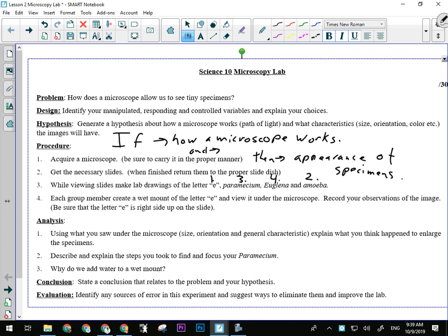There are different dye lots for those. Some of them are all blue, and some have some blue ones, some green ones, some brown ones, and some orange ones. It actually has to do with the genders. Paramecium have this weird thing going on, where they can reproduce asexually by splitting in half, but they can also reproduce sexually by exchanging a small micronucleus that they have in addition to their main nucleus. If there's lots of paramecium around, they'll make these little micronuclei and trade them. Then they'll merge with their main nucleus, and they will be genetically altered and produce non-clones of themselves.